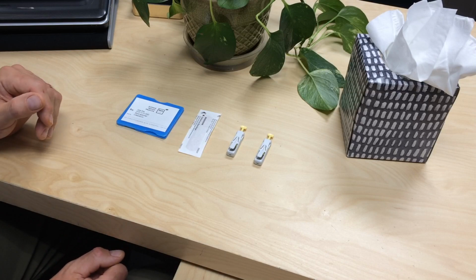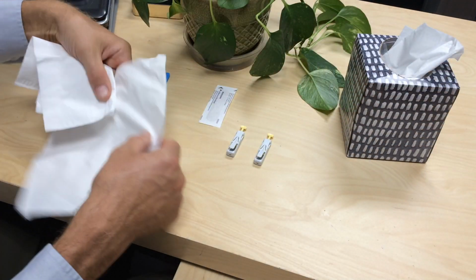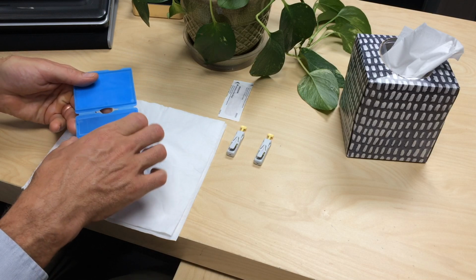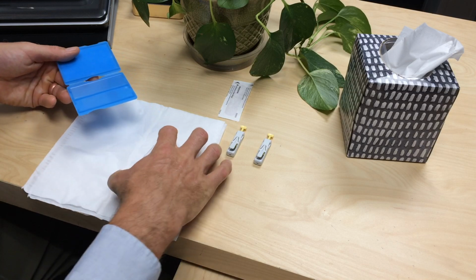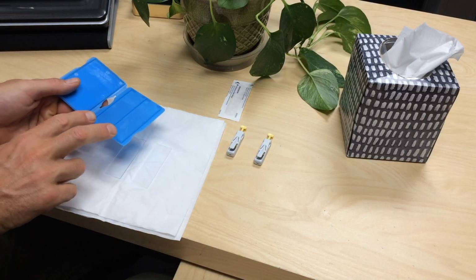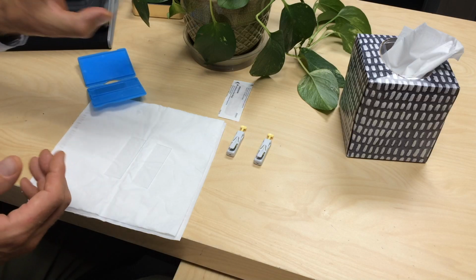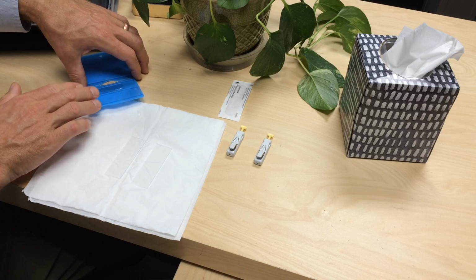First thing you're going to want to do is get 2 tissues or a paper towel and lay them out on the table, and then open the microscope slide case, and inside of there are 4 things. There are 2 microscope slides, which you want to be careful about not getting your fingerprints all over them. Lay them both down on the paper towel or tissue. And then there are 2 microscope slide covers. You're only going to use 1, but these are pretty fragile, so we send you 2 just in case. Try not to get your fingerprints all over it. Rest that on the side of the microscope slide case.